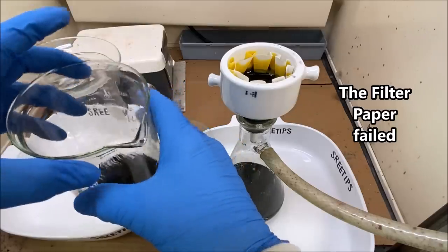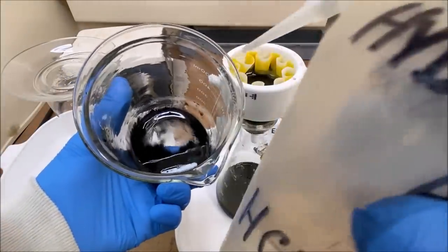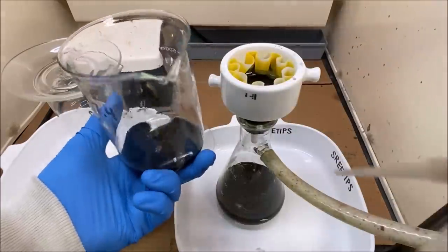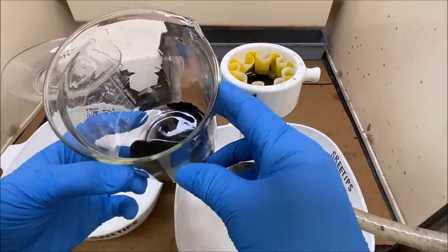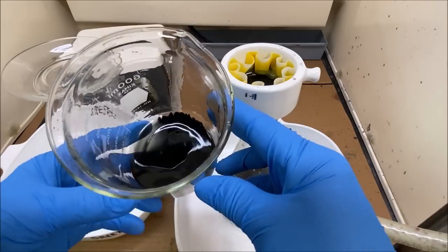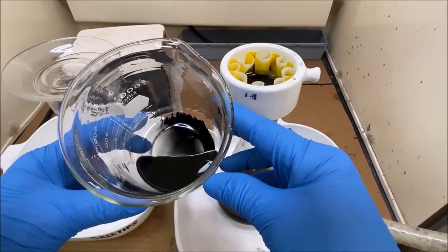So now we get to start all over. If you look down here, we've got a lot of black material in here that did not dissolve. Not quite sure what that is. It might be the iridium. I don't know. I don't have enough experience to identify what that might be.